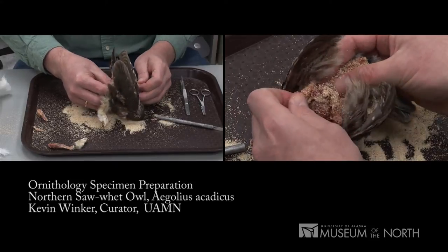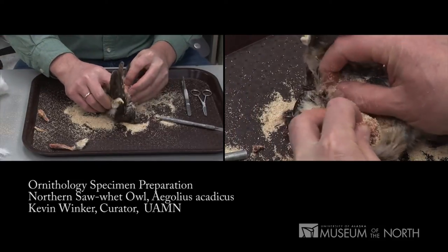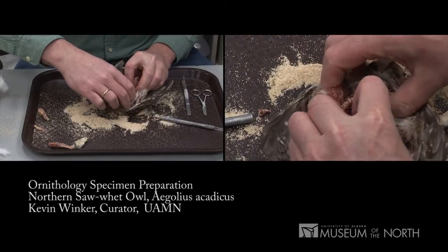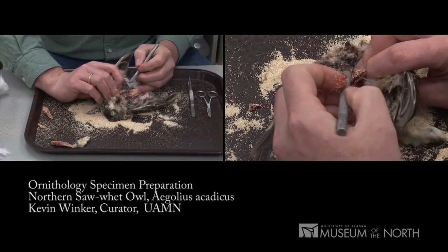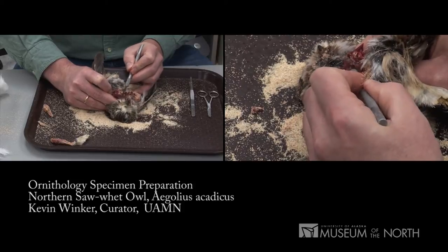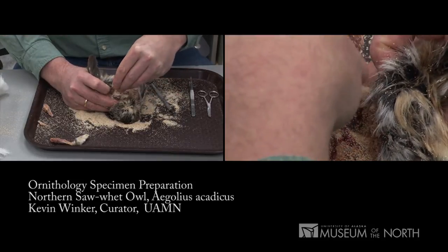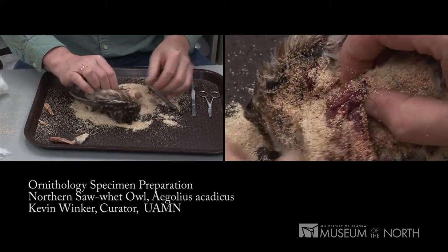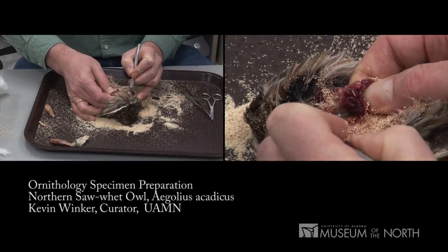There are the two legs we've cut free and the tail, and I'm moving up toward the wings — I'll next disarticulate the bird at the shoulders. As I move along and expose new flesh, I throw corn cob dust in there to absorb the fluids, easing and pushing — never pulling — the skin away from the body. I can see the first shoulder musculature coming visible. I'm disarticulating that joint right through to the skin, then turning the bird over to work the right shoulder. That joint is becoming visible and I disarticulate it to the skin.